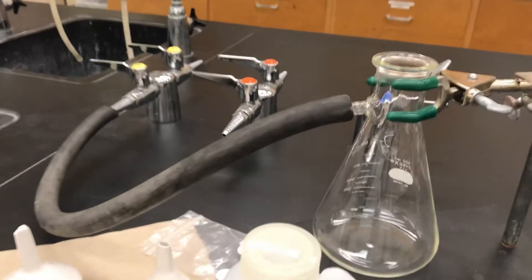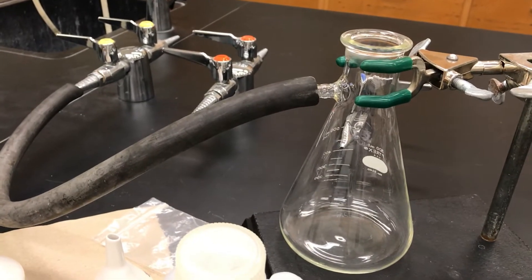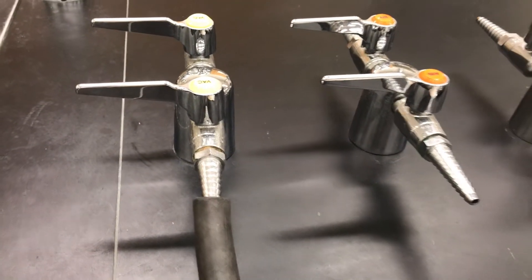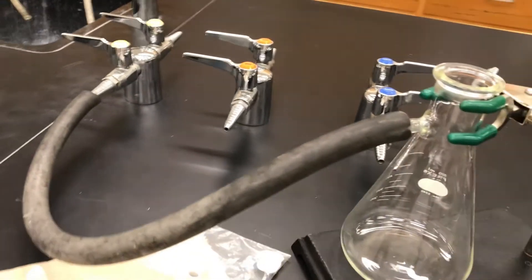So let's first set up our filtration flask. We can connect that to a ring stand and then use some thick rubber tubing to connect the side arm to the house vacuum.